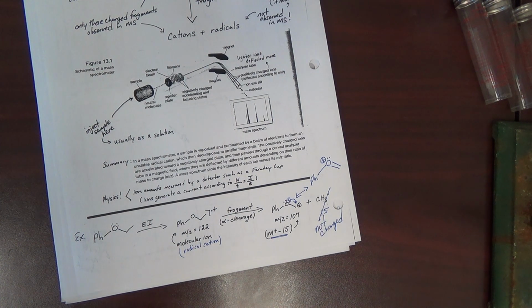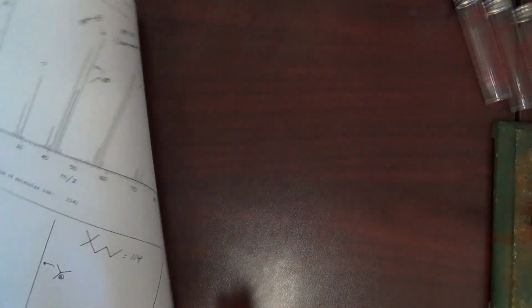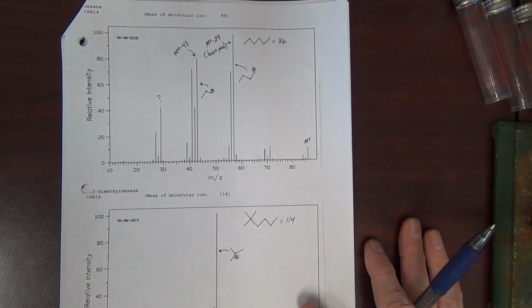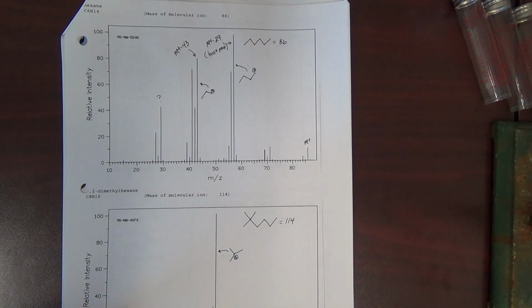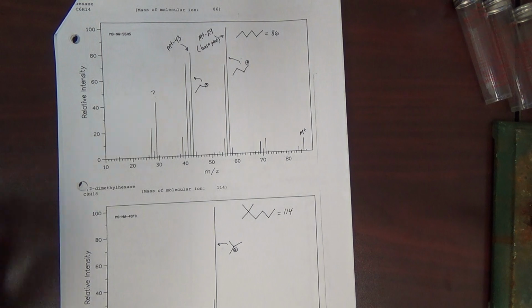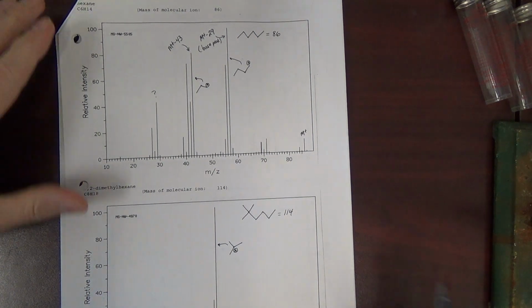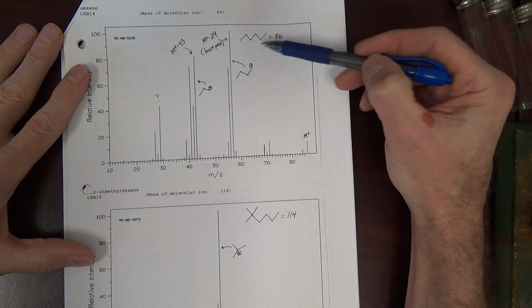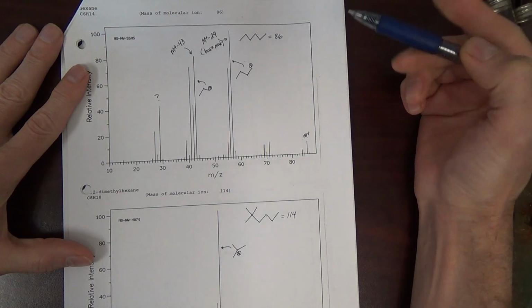Okay. Let's move forward. Going forward, we will look at representative examples of mass specs, very similar to what we did with IR. We'll start with this page, which is some alkanes, simple saturated hydrocarbons.